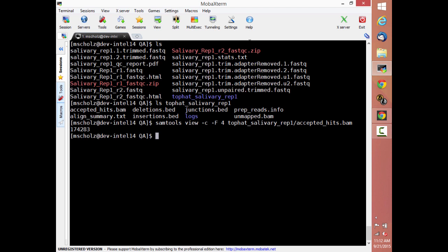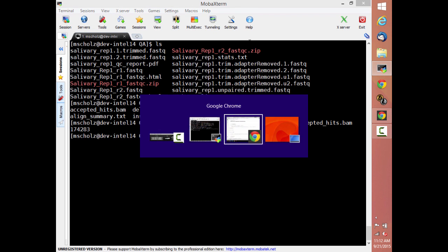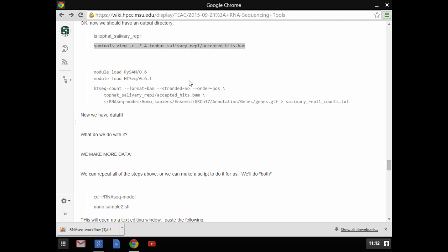75, 70, 65 is probably okay for a semi-model, depending on how much work has been thrown into it, because there's going to be a lot of reads that don't exist there. And if you're doing this with an organism without a reference, you're probably assembling de novo, so this doesn't mean anything, right? So it's going to be a different pathway. That's actually decent, and it could, in fact, be that you're getting multiple reference alignments for the same read, so we're okay. We're not unhappy with that number. So what do we do now?